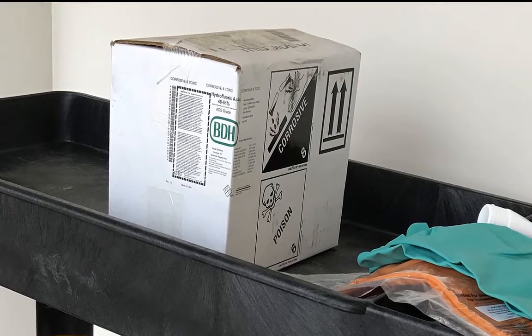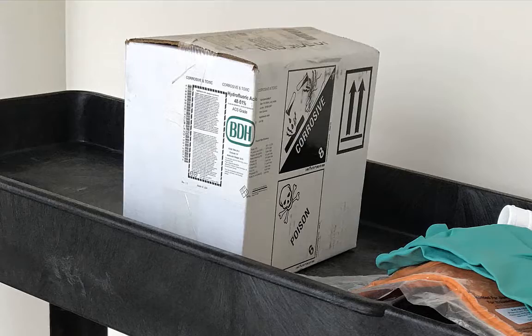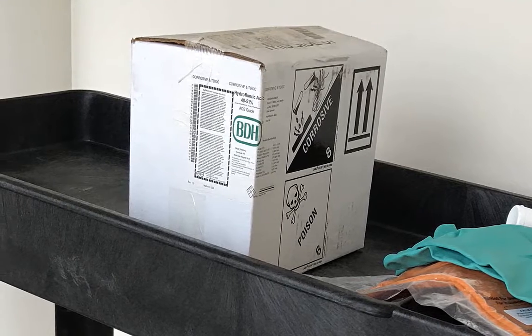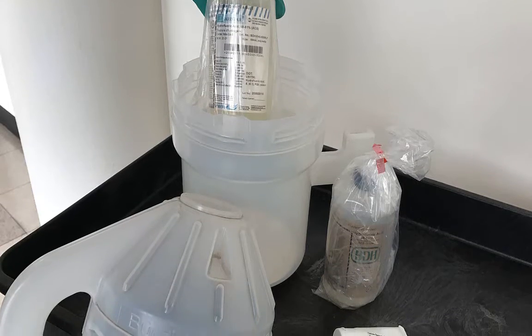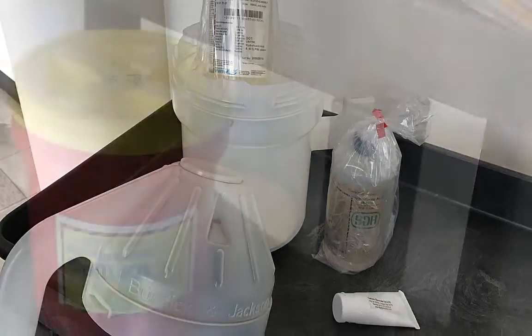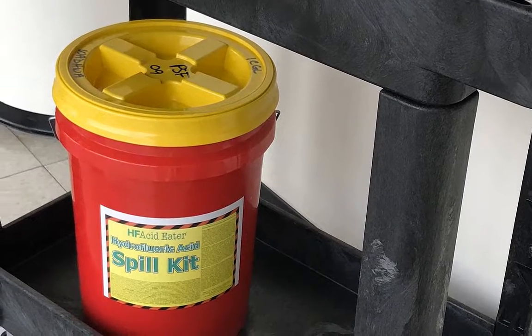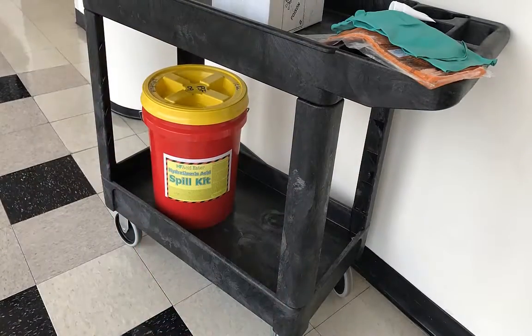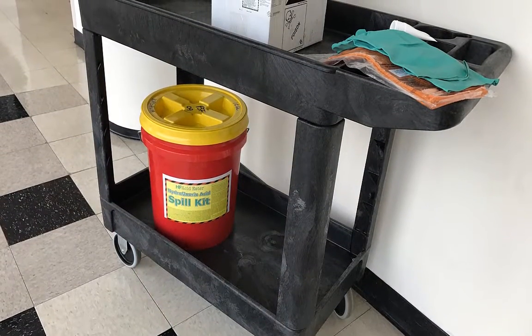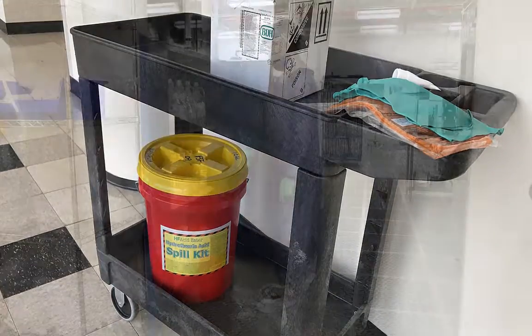When transporting HF, it is preferred that the unopened container remains in the manufacturer shipping box. If you must transport an already open container of HF, use a standard acid carrier or a cart with a lip on all sides. Bring the appropriate absorbent spill kit materials, a tube of antidote, and PPE with you during transport, as well as a buddy whenever possible. If transporting small quantities in a sealed container short distances within your lab, ensure no trip hazards are present.